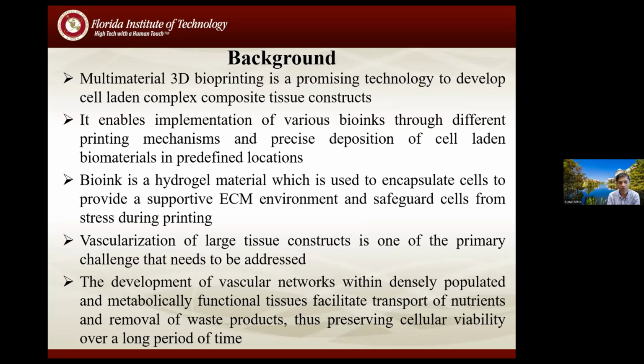So if you are not very familiar with 3D bioprinting, it'll be a good perspective on what it entails. You can basically print multi-material along with multiple different types of cells to create a complex tissue structure. And the biggest advantage is that you can control the tissue structure by using your printer heads. How do you want to structure it? How do you want to deposit the cells? What density? So in essence, you have complete control to create a 3D tissue structure.